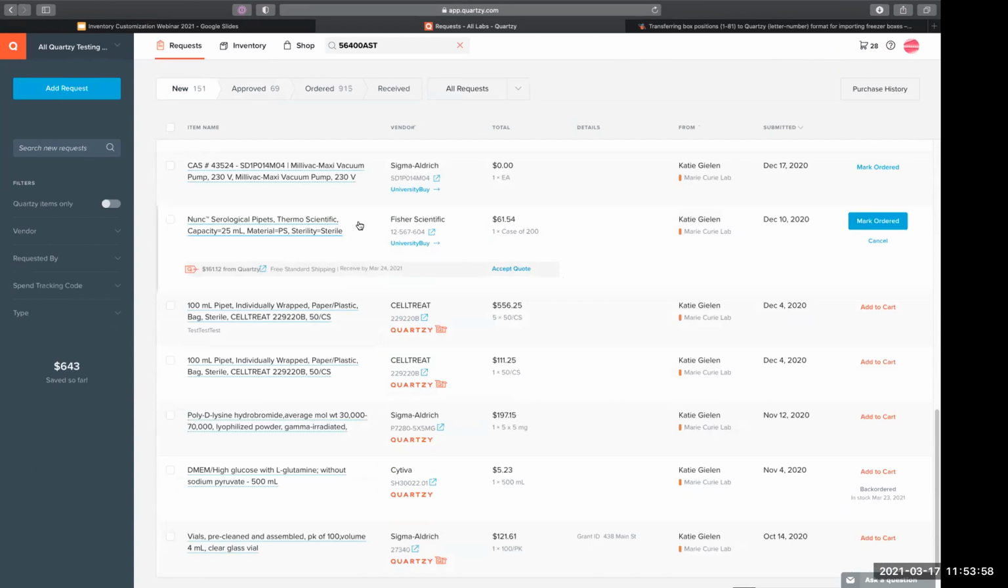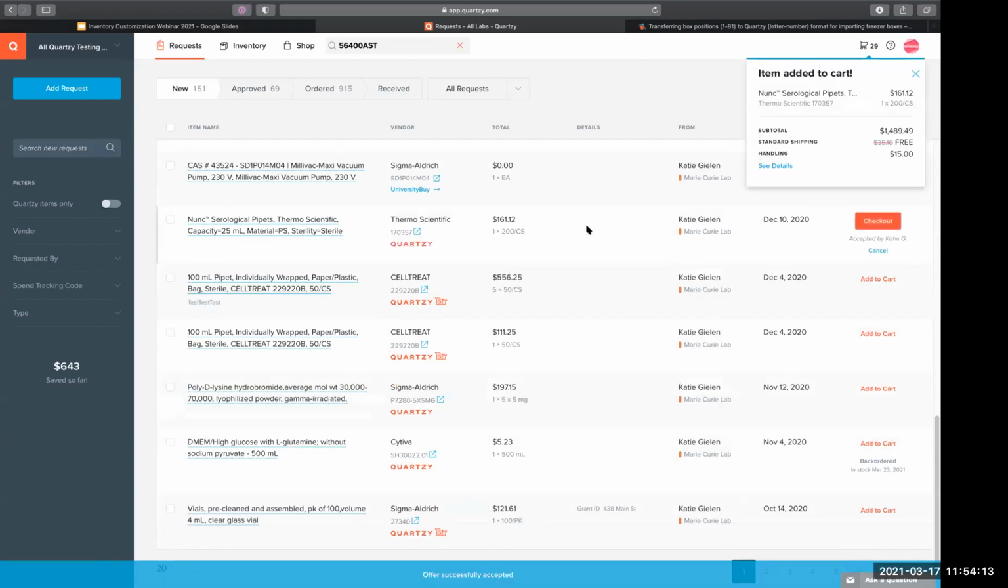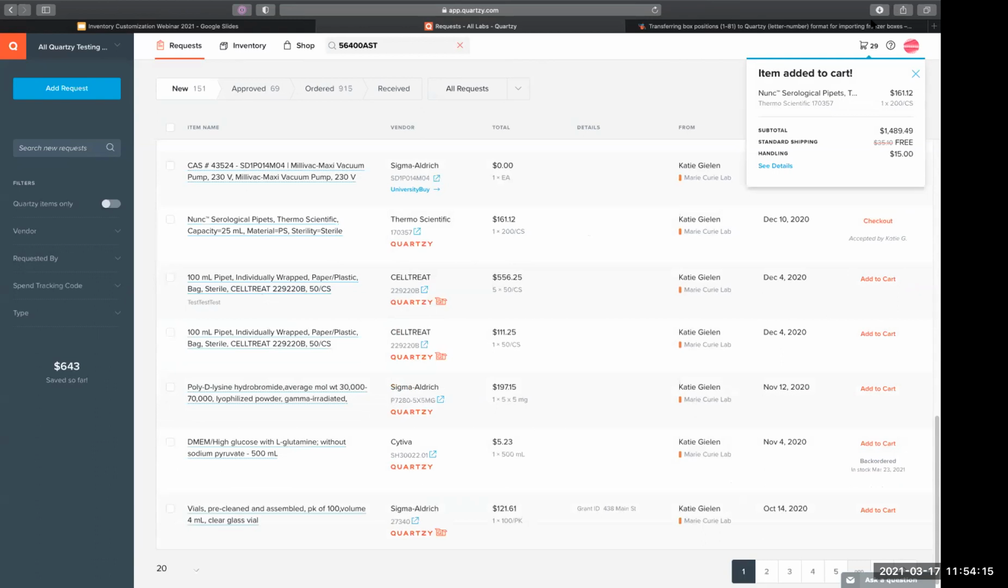We added this as a non-Quartzy item, and then Quartzy says, oh, hey, we can get this for this price and you'll receive it by this time. And you can either accept the quote or just ignore it completely. So if I were to accept that quote, it would automatically update the request and add the item to cart.